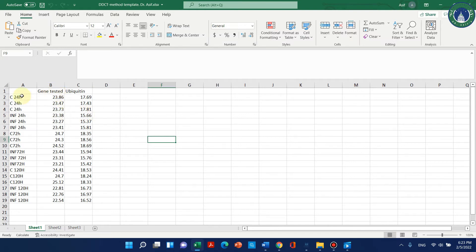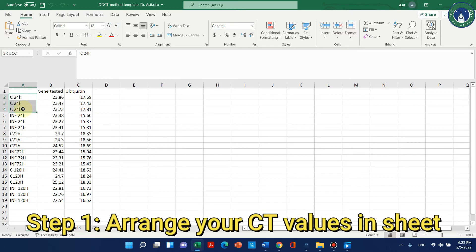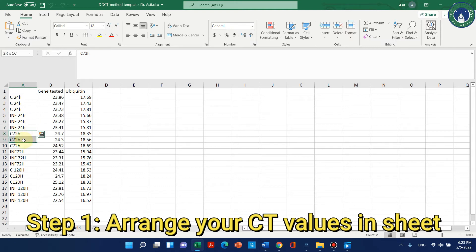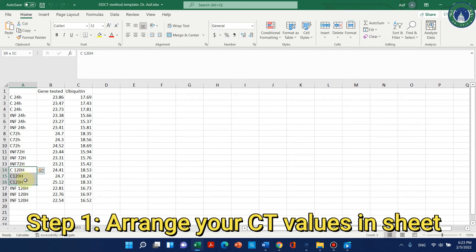Let's suppose we have a few conditions: here we have a control condition and another we have infected, like a treatment. We also have different time points — this is control for 24 hours, this is infected for 24 hours, this is control for 72 hours, this is infected for 72 hours, this is control for 120 hours, and this is infected for 120 hours.